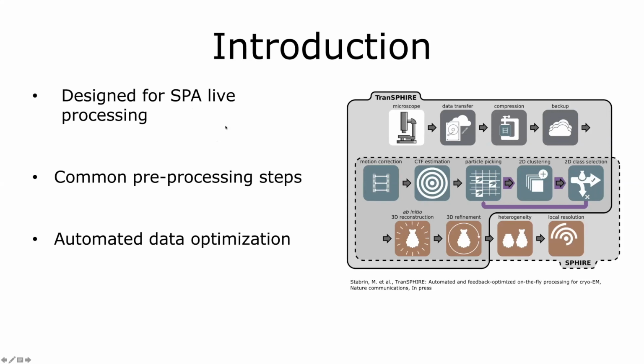I'm not sure if everybody is familiar with the field of cryo-EM and single particle analysis, but in recent years, the hardware and software development, especially in the data acquisition scheme, led to a dramatic increase in throughput.